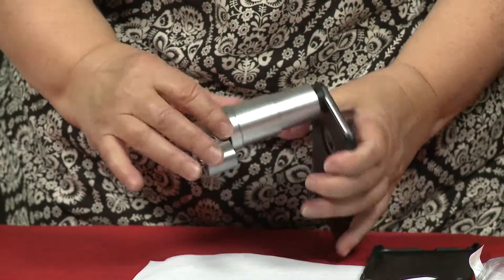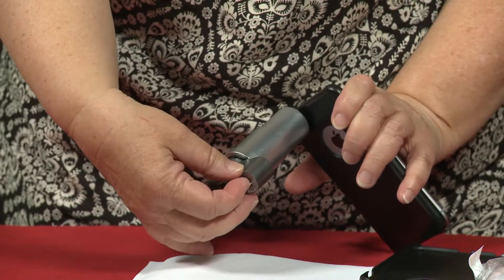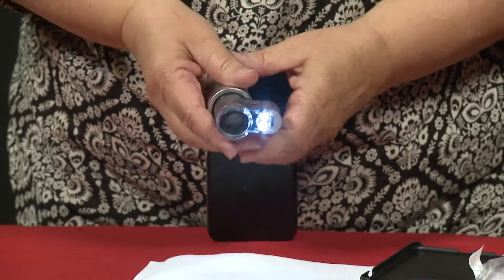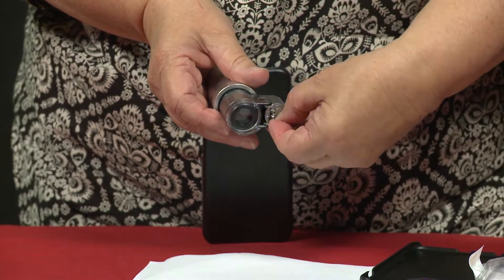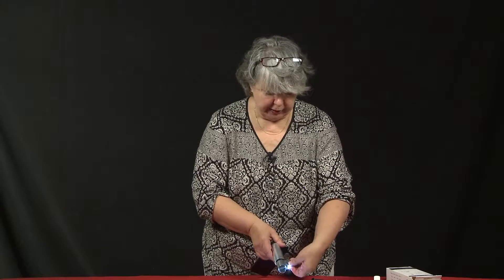Down at this end, here is a light that you can use. It's got two settings. Flipping it one direction gives you a white light, and flipping it the other direction gives you a blue light. I'm going to put it on the white light here.